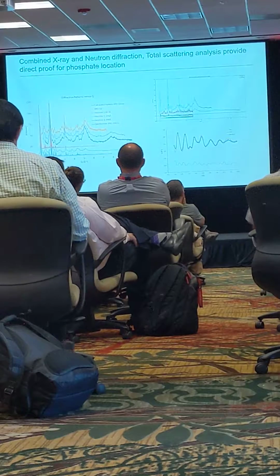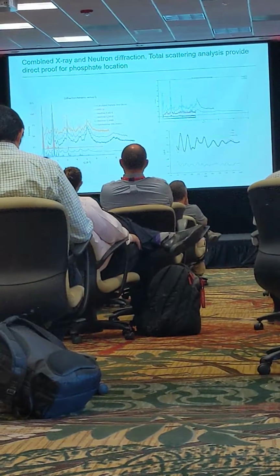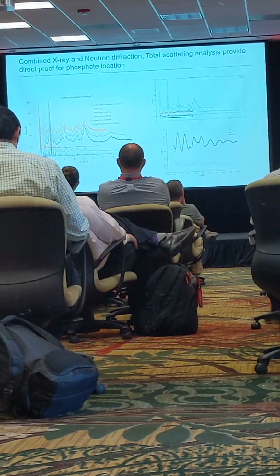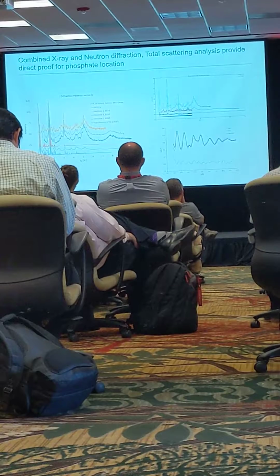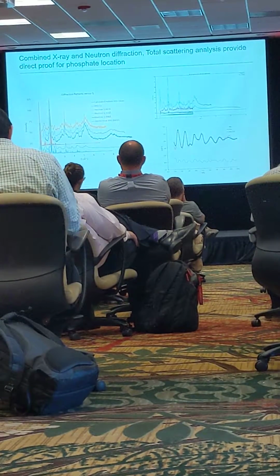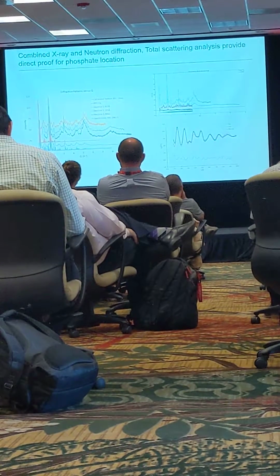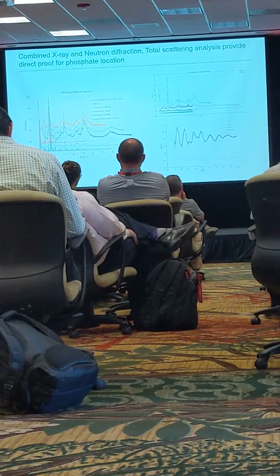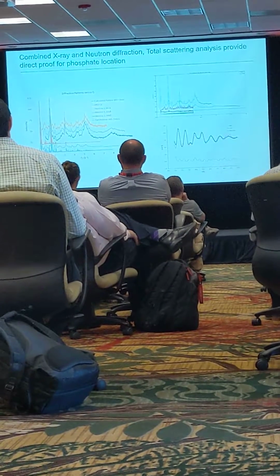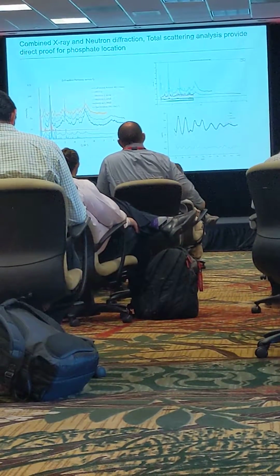Okay, so this is a very complicated XRD plot full of a lot of information, but I'll walk you through it and give you the highlights about it, okay? The first thing I want to mention is that we've got the normal signal of intensity on the y-axis, but instead of 2 theta on the x-axis, we've got something called Q. And the reason we do that is just because it's not dependent on wavelength. So you can take different techniques like neutron and X-ray data and compare them, right? Even because Q is independent of wavelength.